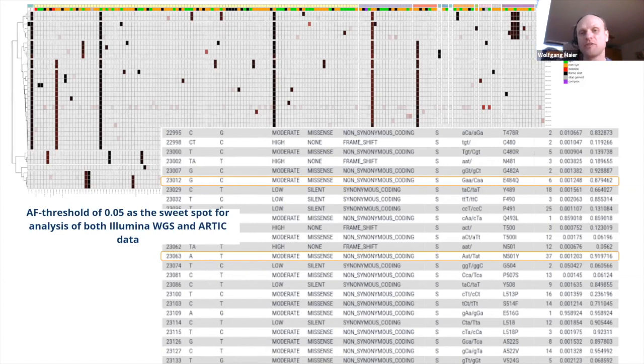If this would be extended to the right, you would see that the allele frequencies for all samples are reported too, and you can also see which samples were above threshold according to your filter settings and which ones were below, so failed to pass the filters, but still showed some evidence for a variant that an above threshold sample provides evidence for.